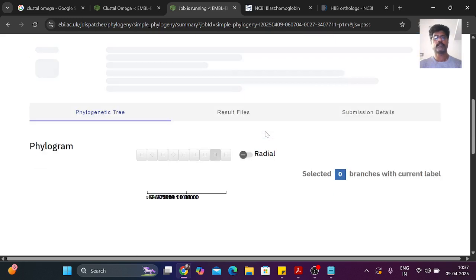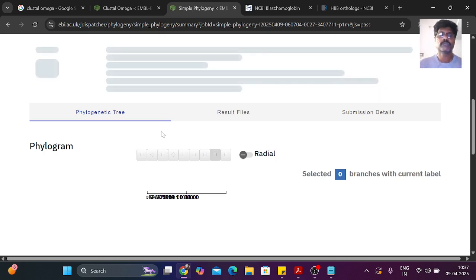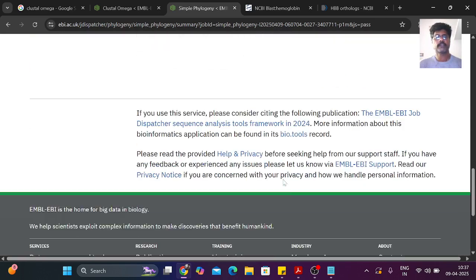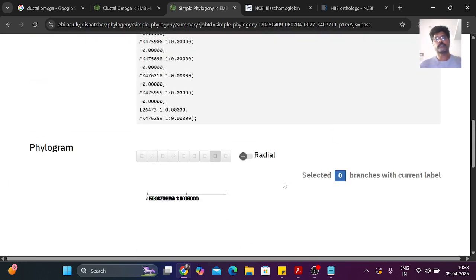See that it takes time to create. Same thing is coming. So maybe that much close. Actually, all the options here should be loaded, right? If not loaded, it means there is a problem in the network, which means the internet. I just try.